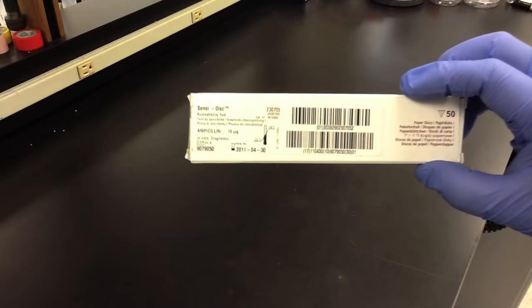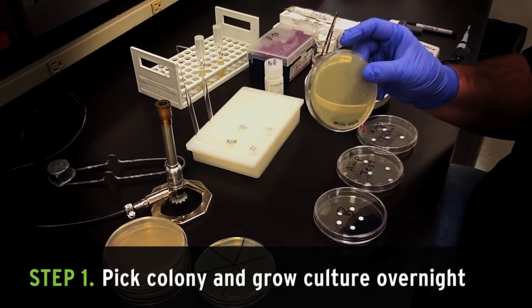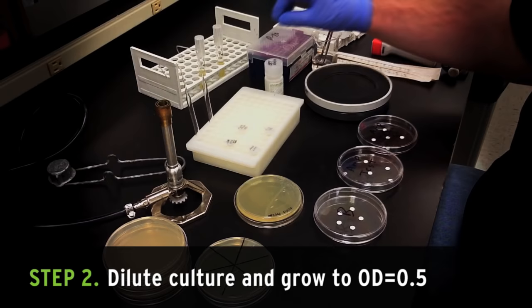We'll need two bacterial cultures, one that's susceptible to the antibiotic you're testing and one that's resistant. The day before you want to test, grab an isolated colony from a plate and grow overnight. The day of the test, dilute your cultures back and grow to about mid-log phase, around an OD of 0.5.